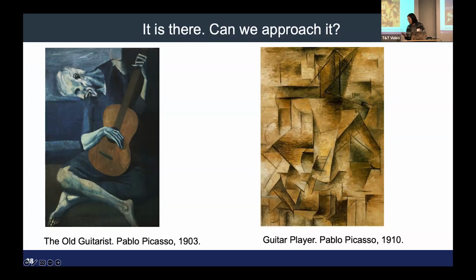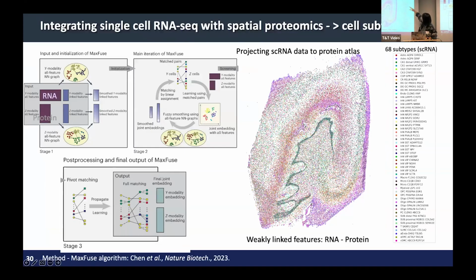But an easier way to look at neuron subtypes is to project the single cell data, because with single cell you get all of those inhibitory and excitatory profiles at the same time. As an example here, when we project, these are all the inhibitory neurons: MEIS2, parvalbumin, SST, VIP. We have their location in the atlas, so you can take a quick look at where they likely are.